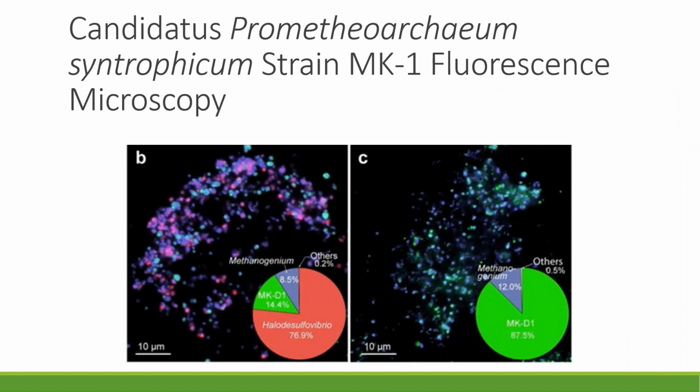However, by using fluorescence microscopy, we can detect fluorescent signals from each of the different types of bacteria. And we can apply a computer software program to count those individual particles based upon their color, or count those individual bacteria, in order to ascertain the total size of their population within the culture.